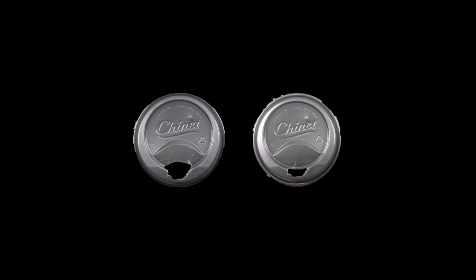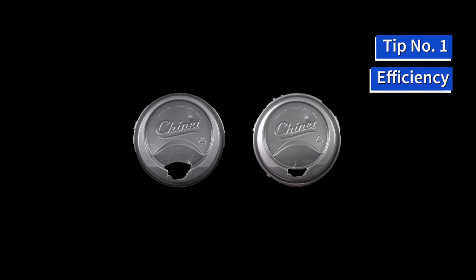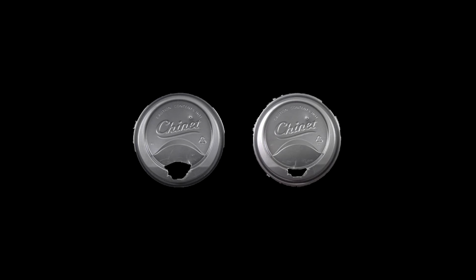On a practical note, please make sure that the lid you use fits securely and also has as small of a hole as possible in order to limit the amount of heat that can escape.